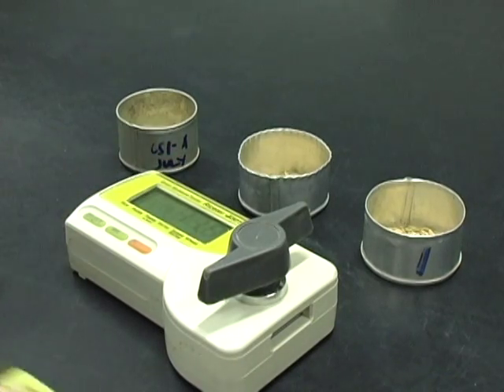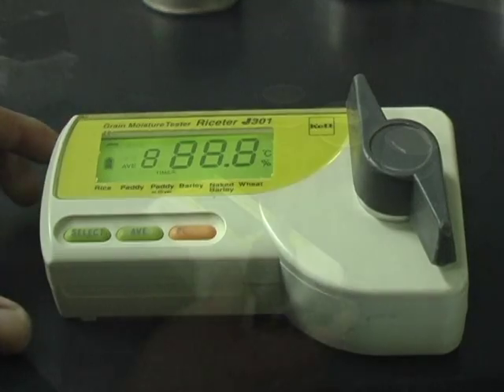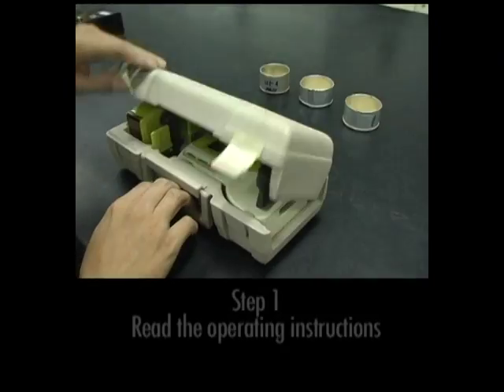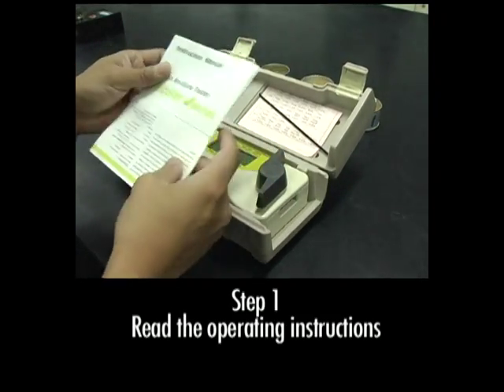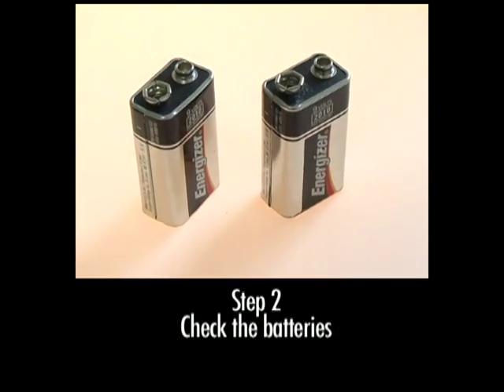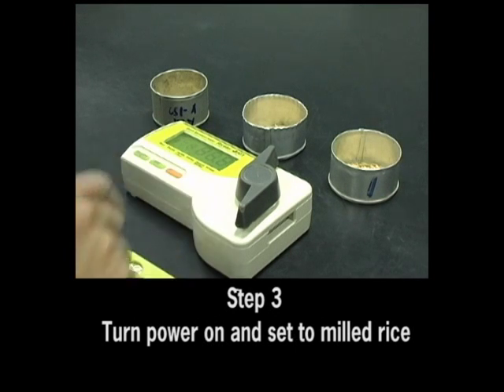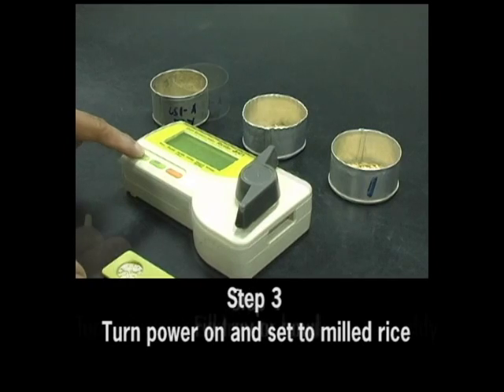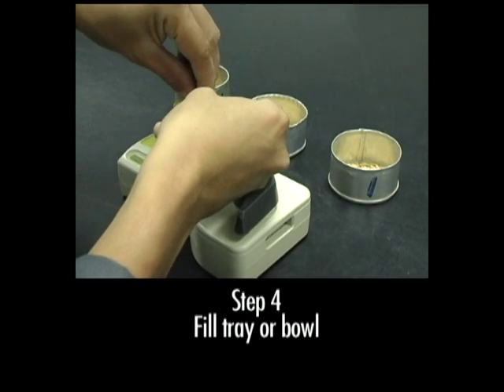Moisture content of milled rice is the weight of water remaining in the grain. Moisture content should not be higher than 14% to prevent molding. To use a moisture tester, first, read the operating instructions. Then check if the batteries are still good. Next, turn on the power and make sure that the machine is set for milled rice. Then fill the tray or bowl of the moisture tester with a milled rice sample.